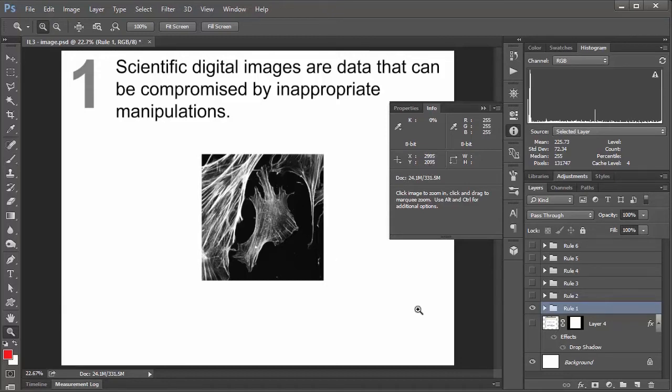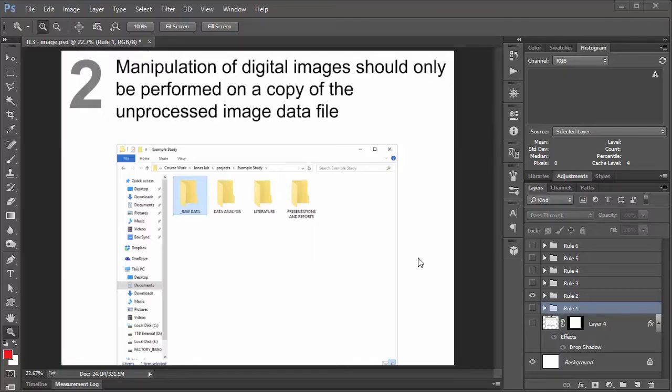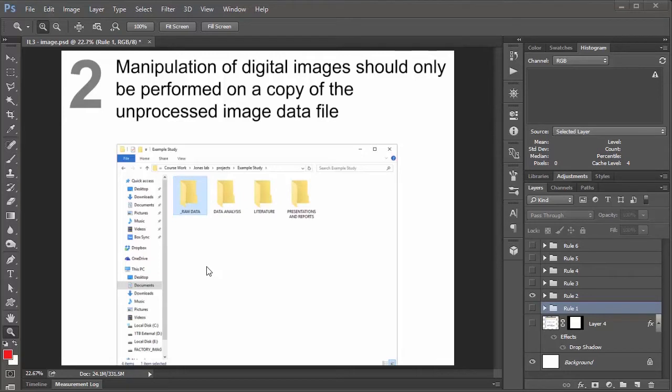Okay, so that'll bring us to rule number two. Rule number two. Manipulation of digital images should only be performed on a copy of the unprocessed image data file. So I think this one is pretty self-explanatory. But to give you an idea of how extreme you can get, when I worked in a GLP lab a couple of years ago, where record keeping was crazy, we saved copies of everything.